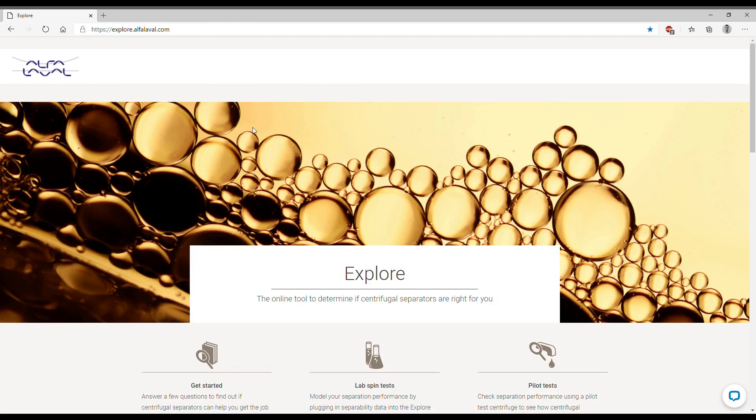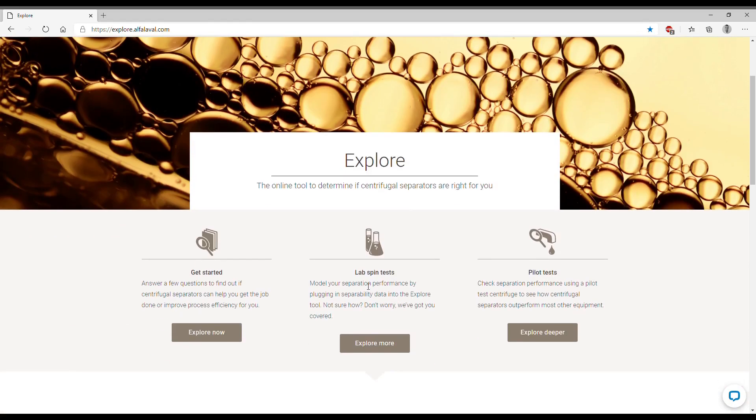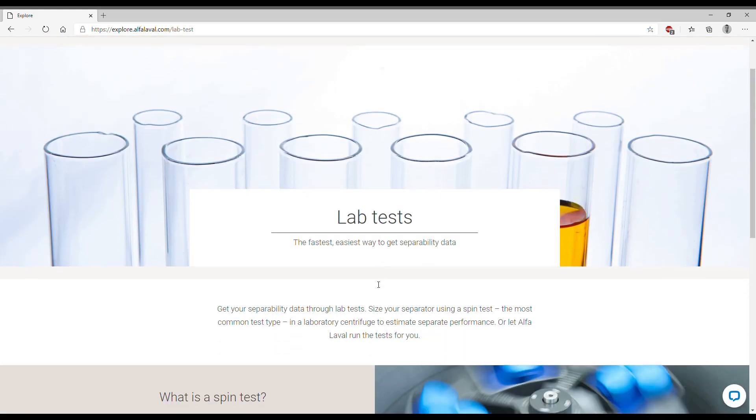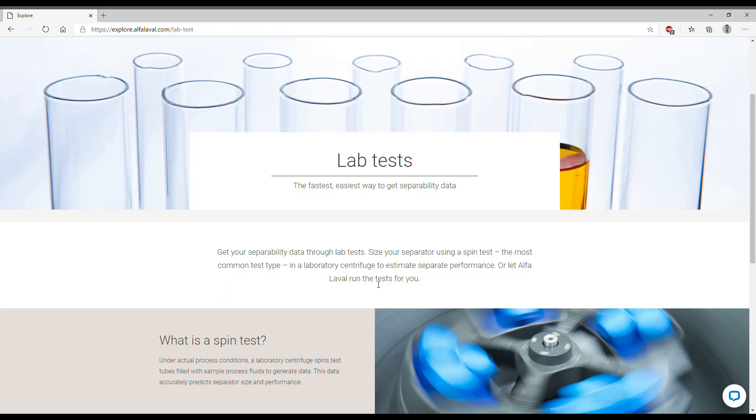This time we are going to work with the lab spin tests so we need to click on explore more. Once we do that we reach the first page of this sub portal starting with what is a spin test, a short description and an explanation why they are so important.